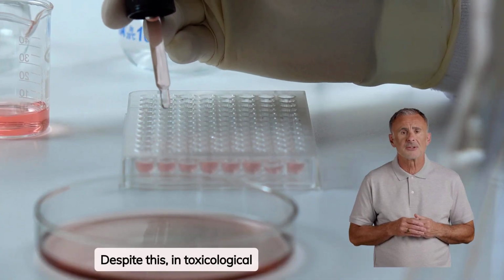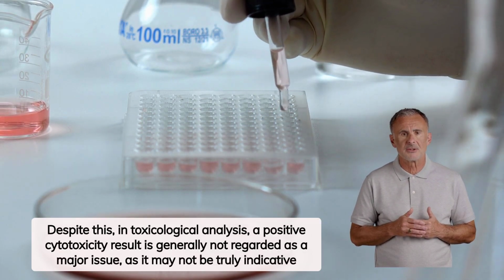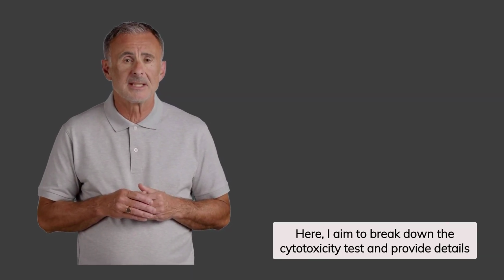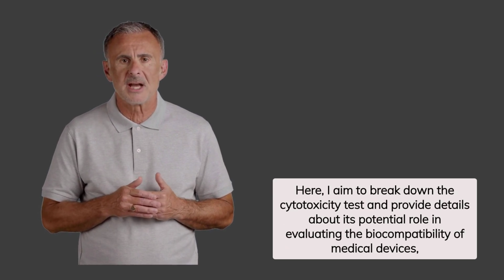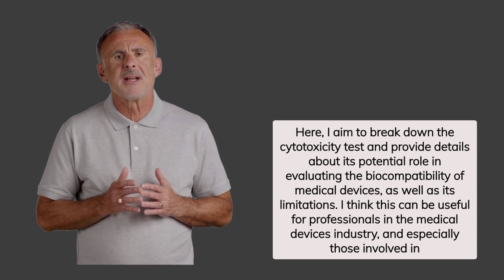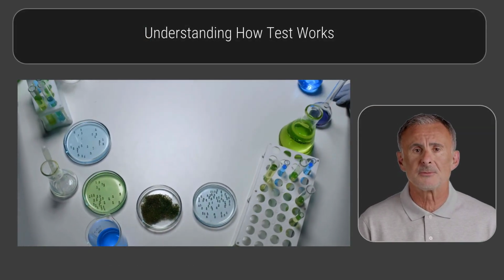Despite this, in toxicological analysis, a positive cytotoxicity result is generally not regarded as a major issue, as it may not be truly indicative of in vivo or human toxicity. Here, I aim to break down the cytotoxicity test and provide details about its potential role in evaluating the biocompatibility of medical devices, as well as its limitations. I think this can be useful for professionals in the medical devices industry, and especially those involved in R&D, quality, or regulatory compliance. First, let's see how the test is performed.